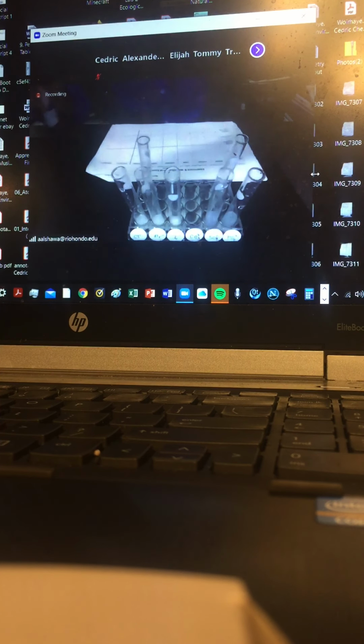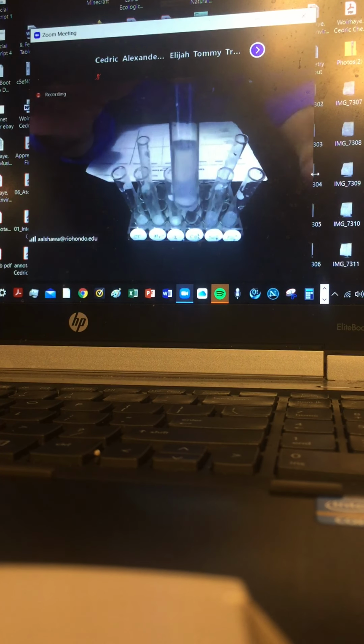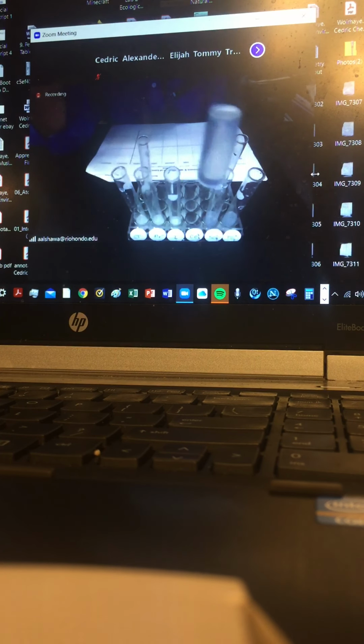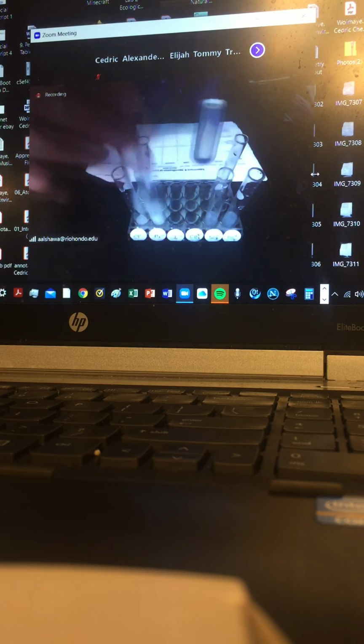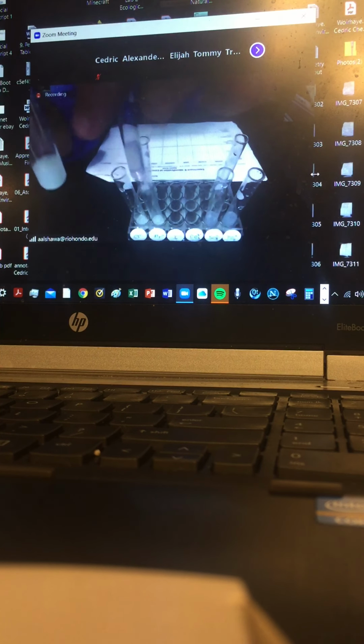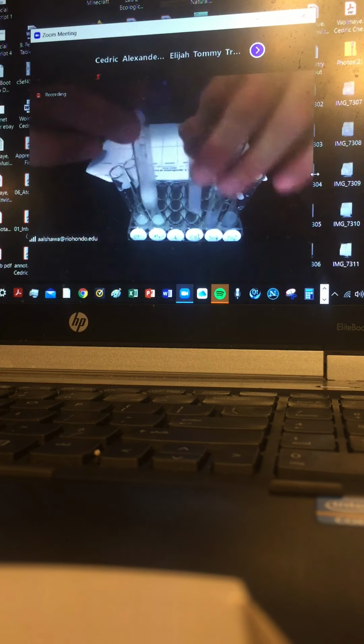So maybe if I add maybe 2 drops of that, so just add maybe another shot. So just add a little bit more of that. I don't have enough of nitric acid, but look what happened. Okay, so this is the addition of the, so compare that to those halides. So this is iodide, okay, and this is the used to be carbonate, so it's clear.